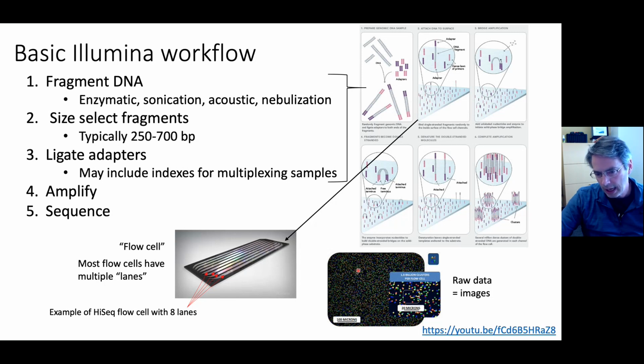And then what's happening is something called sequencing by synthesis. It's really a camera taking pictures of these clusters. I've got some more slides to show how that works.